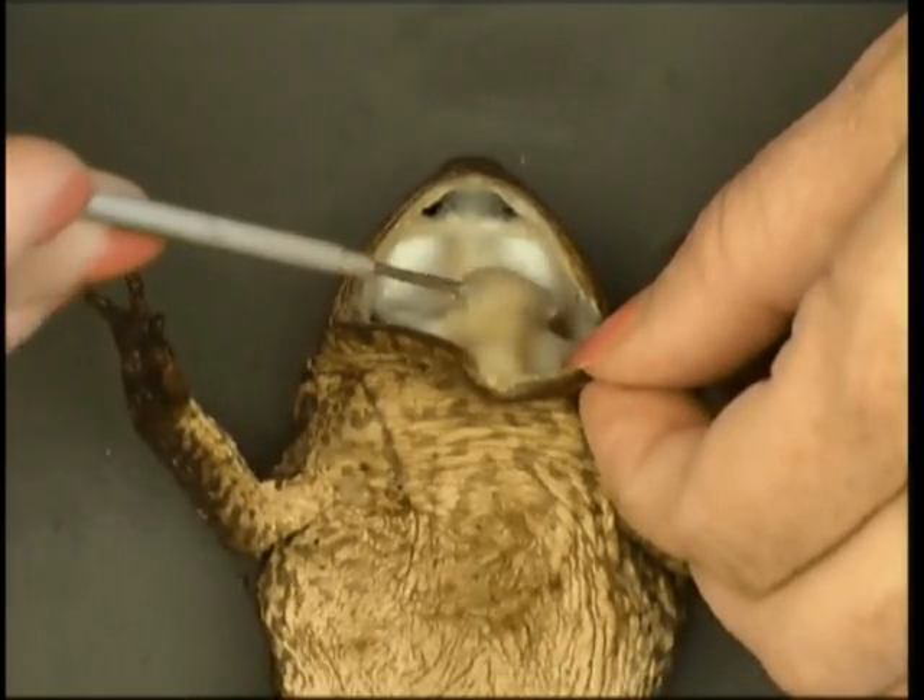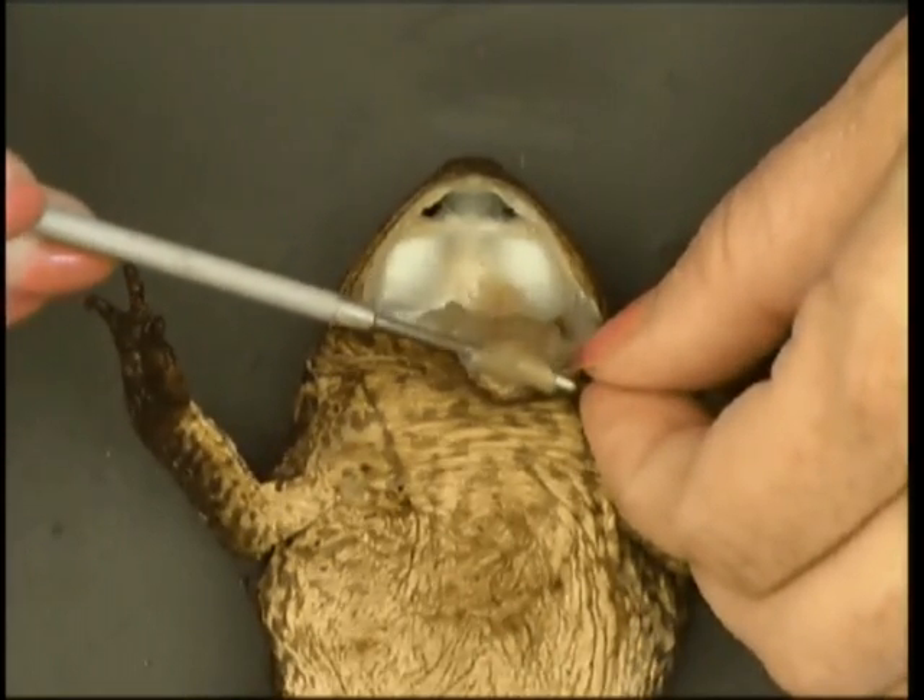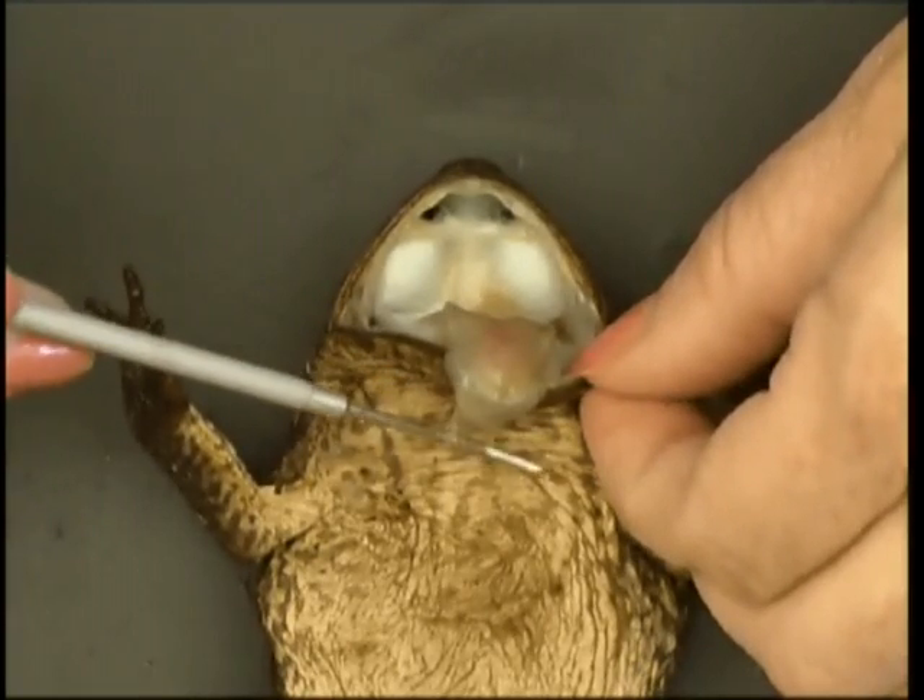Here we have the tongue, and it's attached to the front, so they can flip it out to catch flies or insects.